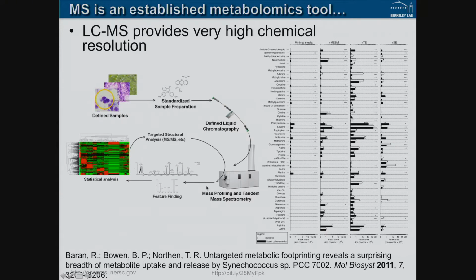Okay, so I'm going to shift gears just a little bit. Much more common than mass spectrometry imaging is mass spectrometry coupled with liquid chromatography. So everything about the mass spectra is still the same. We require mass spectra in large abundance. But there's no imaging.